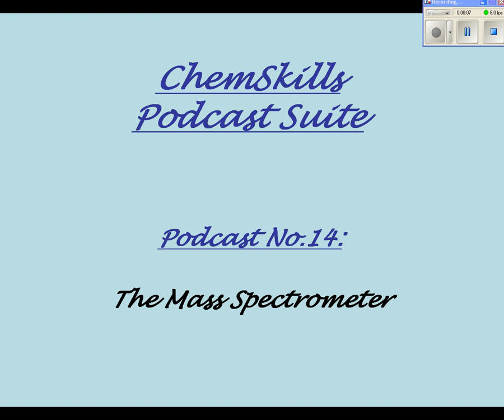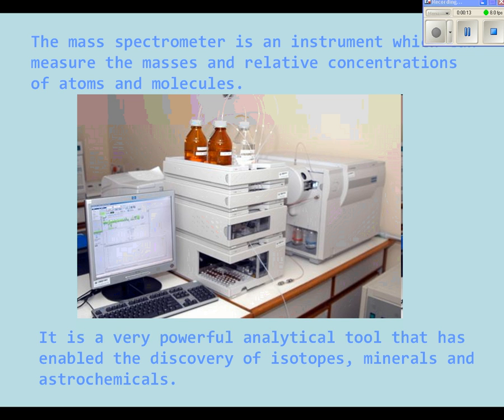This is the 14th podcast in the series and the topic of this session is the mass spectrometer. The mass spectrometer is an instrument that measures masses and relative concentrations of atoms and molecules. It's an incredibly powerful tool that has a very high degree of precision, and it has been responsible for the discovery of many isotopes of elements, minerals, and even astrochemicals.